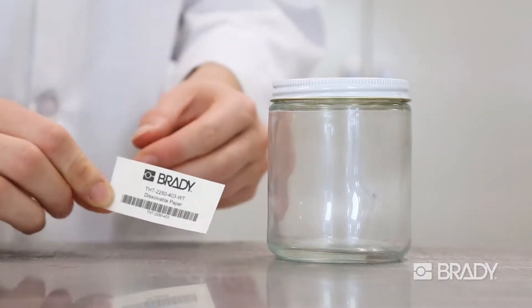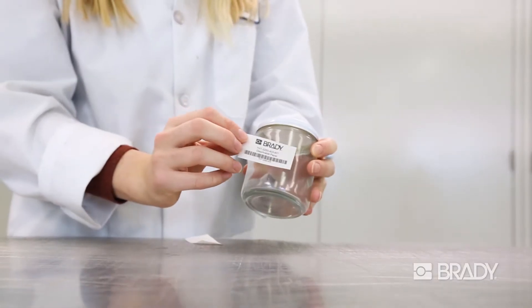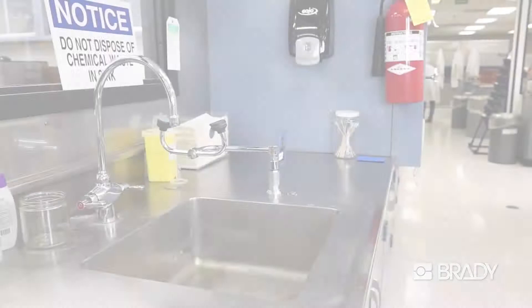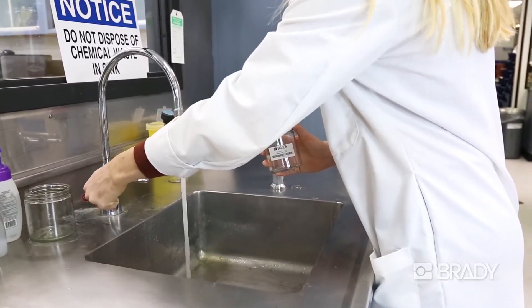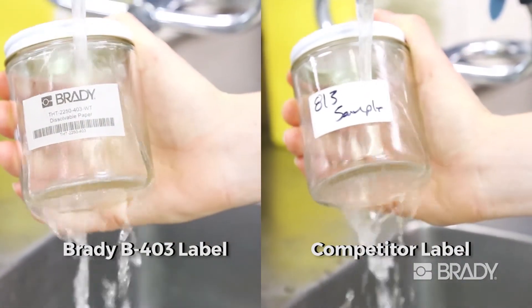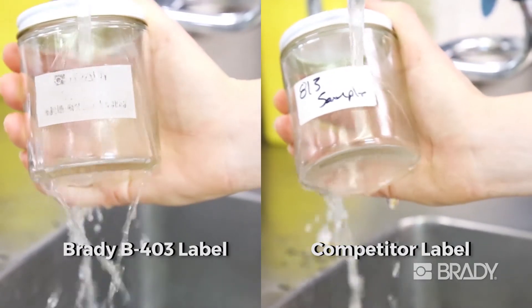Brady's B403 dissolvable paper identification labels are an ideal solution for temporary applications. B403 labels offer easy removal and re-identification of glassware labeling. Labels completely dissolve in warm water within seconds, leaving no adhesive residue.